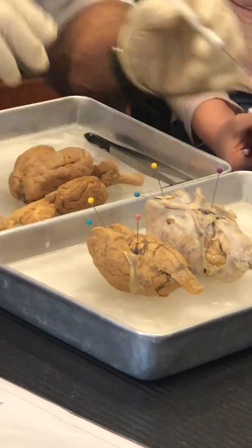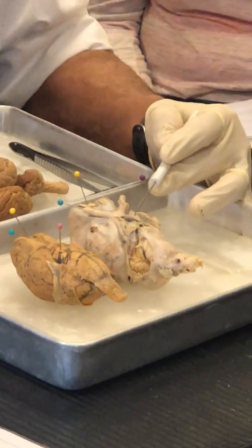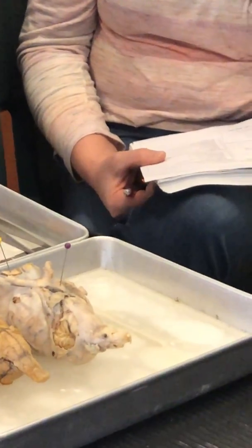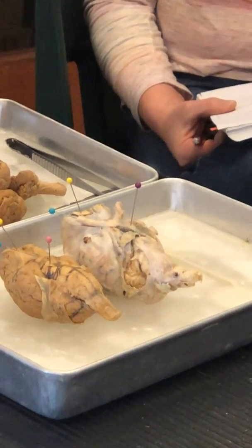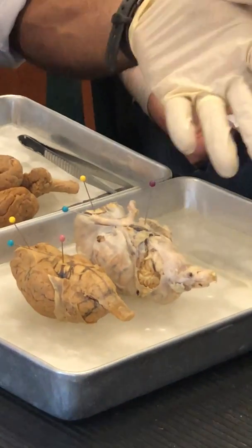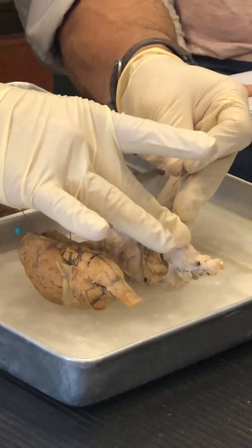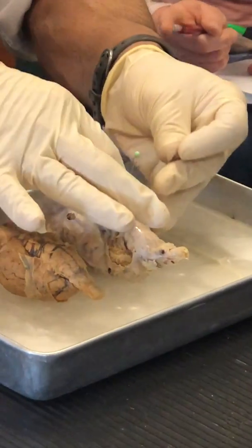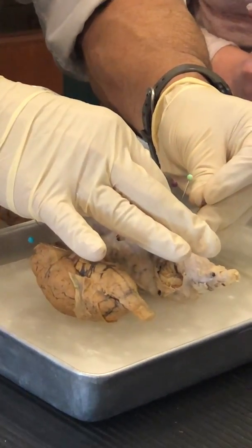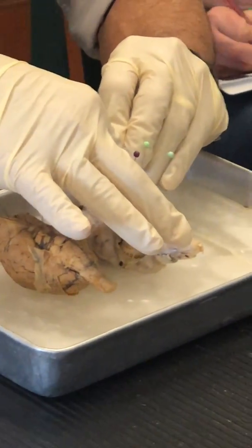Then, folks, notice over here, I'm going to count here. Notice there's 1, 2, 3 branches over there. It's not quite that clear on that side. And that nerve right there is cranial nerve number 5. Notice not number 4, number 5. So we've got 1, 2, 3. We can't see 4, so we jump to 5. And what is that nerve called? That nerve, there are 3 branches. 3 branches. The biggest of the cranial nerves. I'm going to stick the pins into the 3 branches. And that nerve is called the trigeminal nerve.